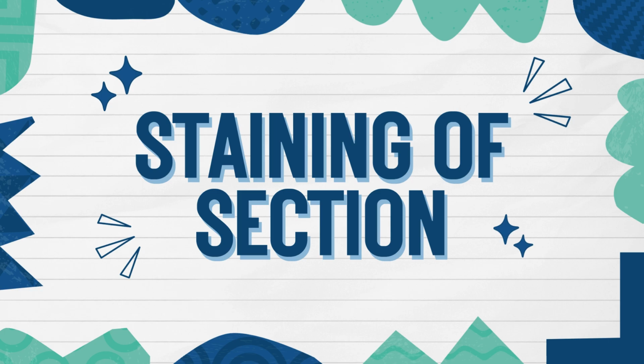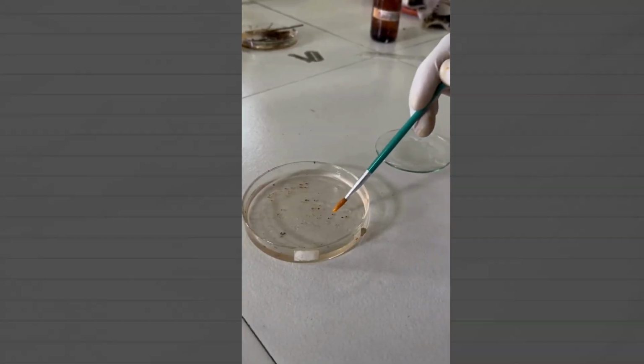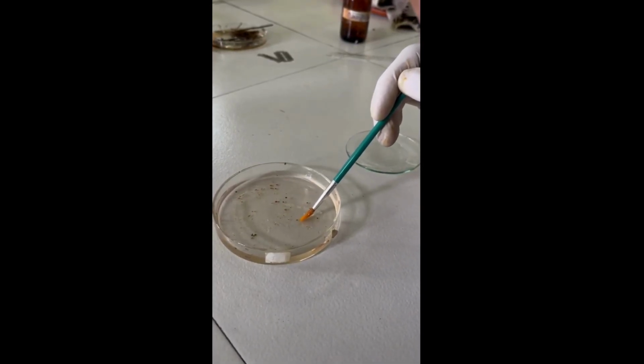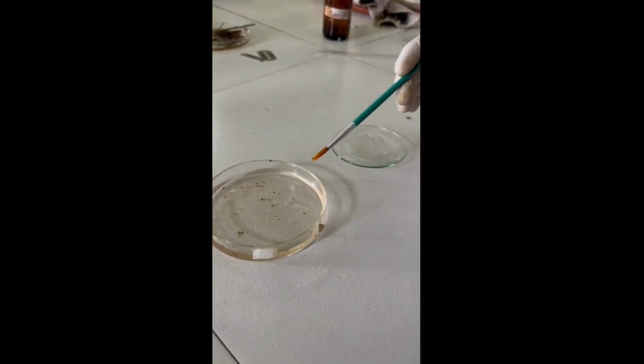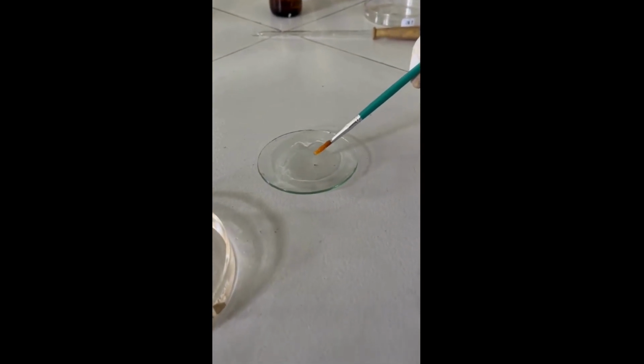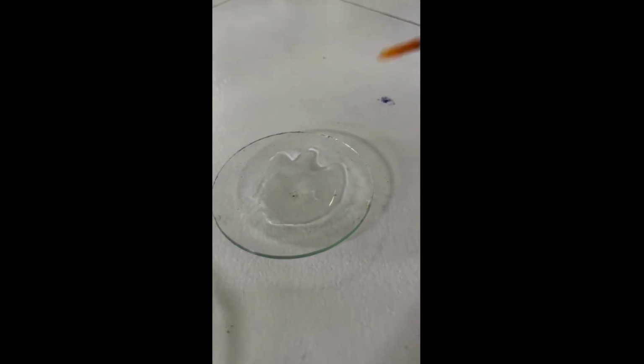Staining of section. The section of ephedra which needs to be stained is picked carefully using a fine paint brush. Immersed in the HCl and phloroglucinol mixture previously prepared on a watch glass.